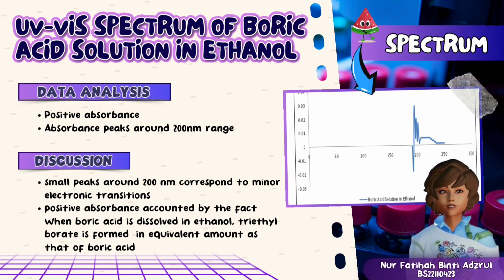The data results show positive absorbances and absorbance peaks around the 200 nm range. The positive absorbance can be accounted for when boric acid is dissolved in ethanol. Triethyl borate is formed in equivalent amount as that of boric acid and may thus give a positive absorbance.